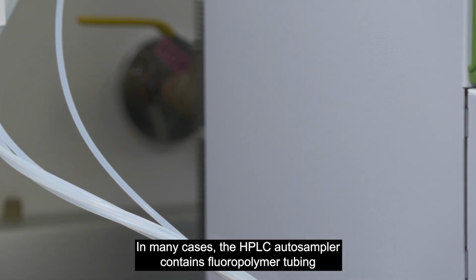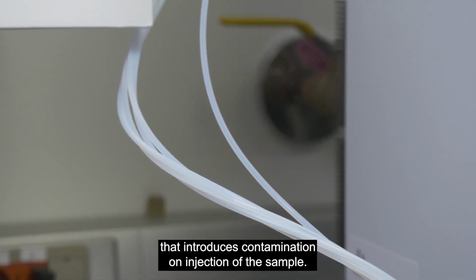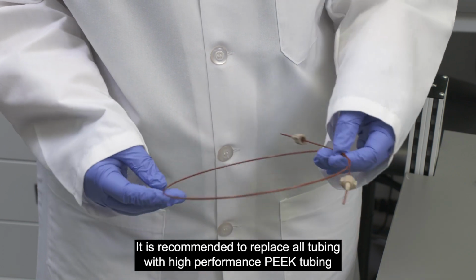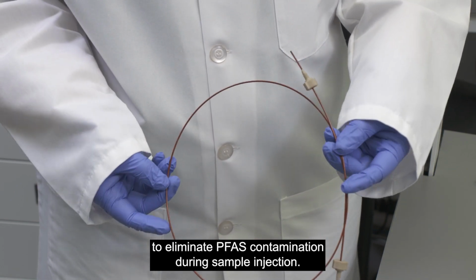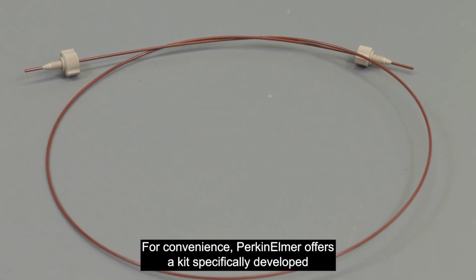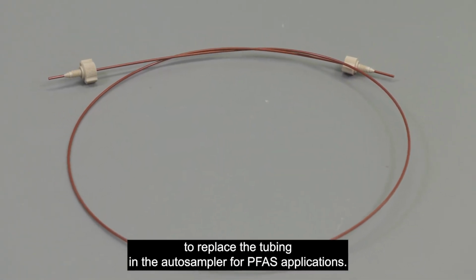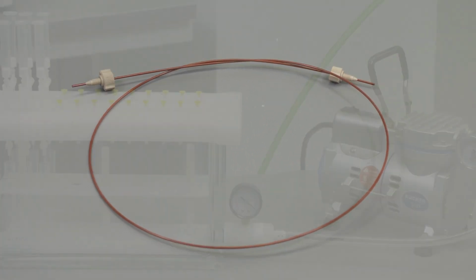In many cases, the HPLC autosampler contains fluoropolymer tubing that introduces contamination on injection of the sample. It is recommended to replace all tubing with high-performance PEEK tubing to eliminate PFAS contamination during sample injection. For convenience, PerkinElmer offers a kit specifically developed to replace the tubing in the autosampler for PFAS applications.